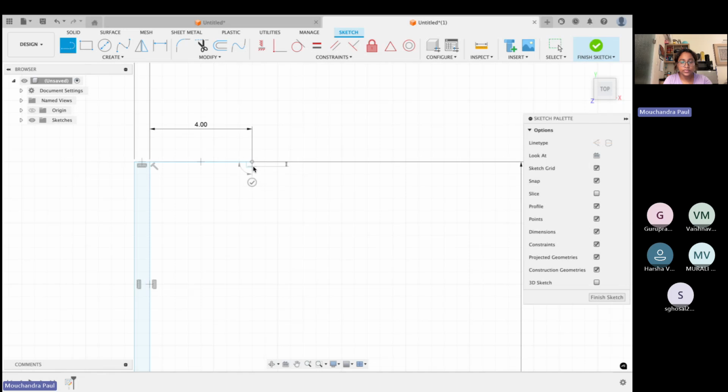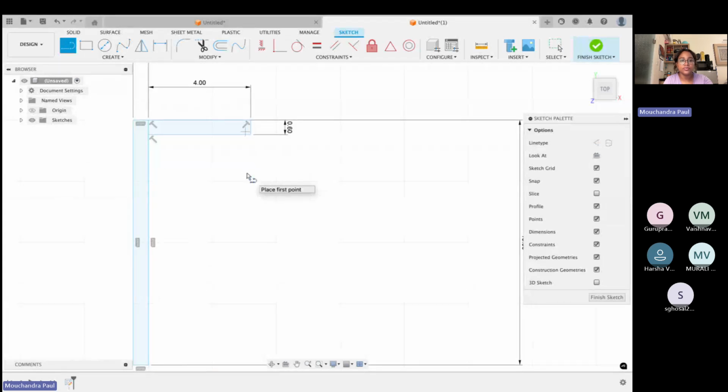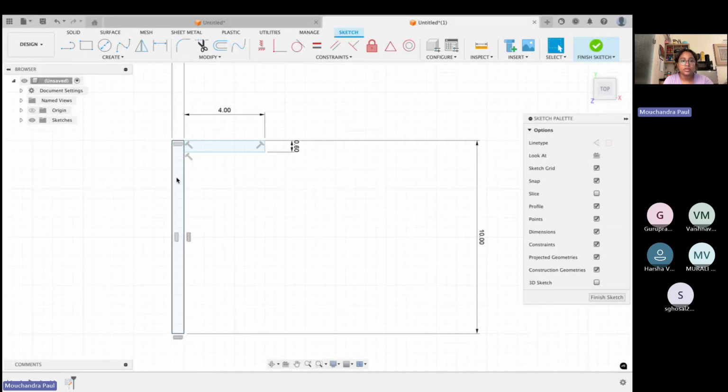It is 0 degree. This line basically helps me to adjust the height and all. 90 degree, you can see, you can always make sure the edges are very nice, like this. This is one L shape that is formed. Now this is the one.